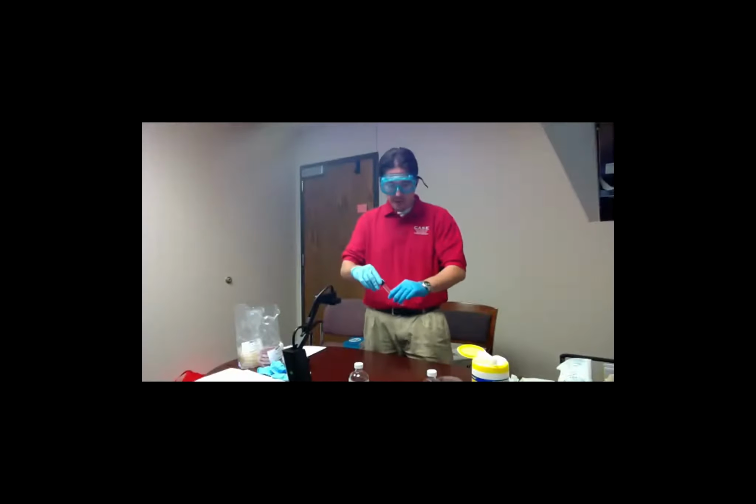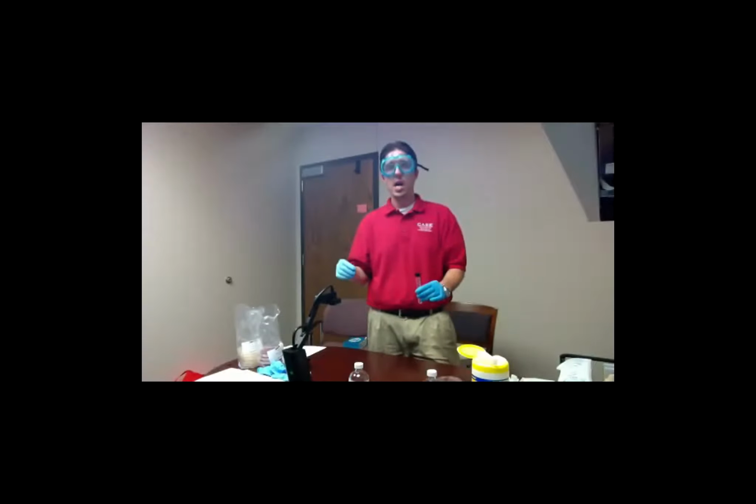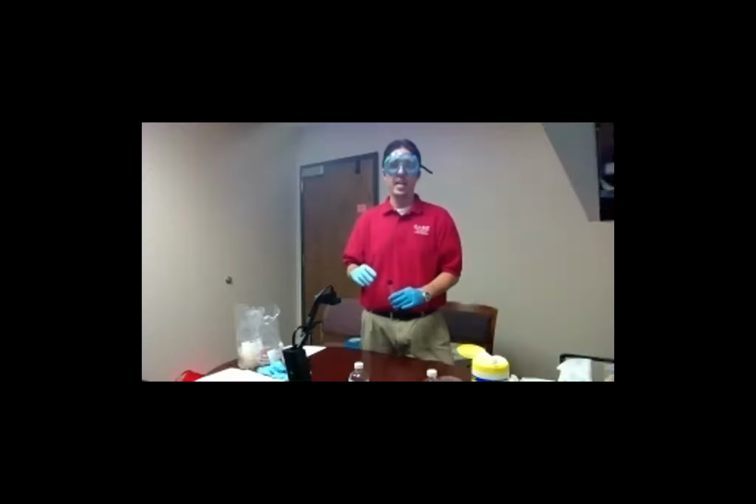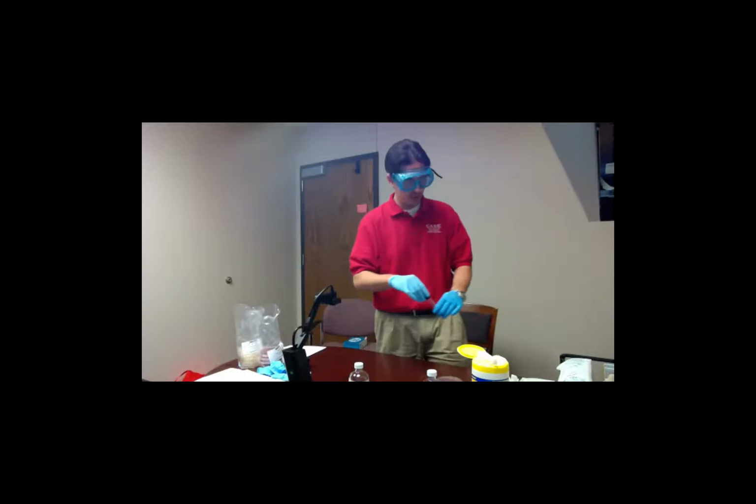So before I show you how to plate a sample, we're going to watch a couple YouTube clips that we have sent you in the email, but these are clips of how this is done in an actual lab, and then we're going to show you how you probably do it in your classroom.